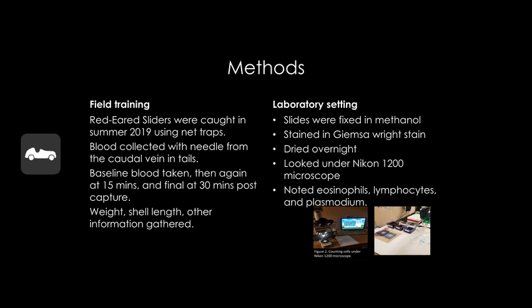Slides were examined under the Nikon 1200 light microscope for observation of red blood cells and white blood cells. I noted any Plasmodium in the red blood cells and counted eosinophils, heterophils, and lymphocytes.